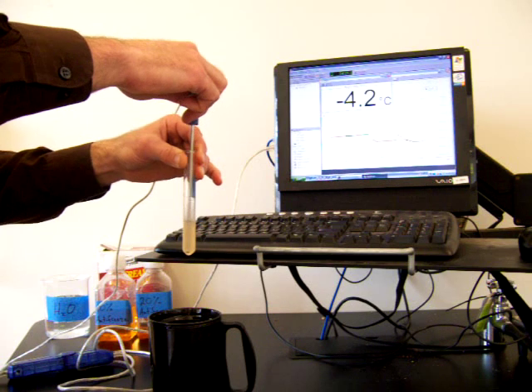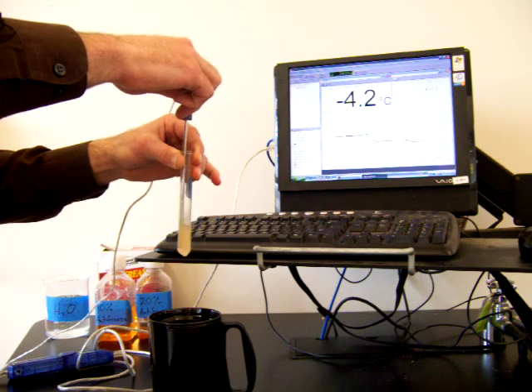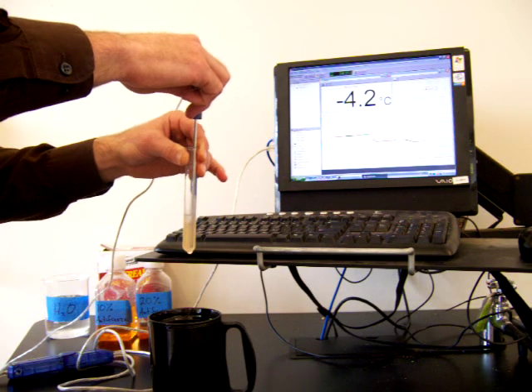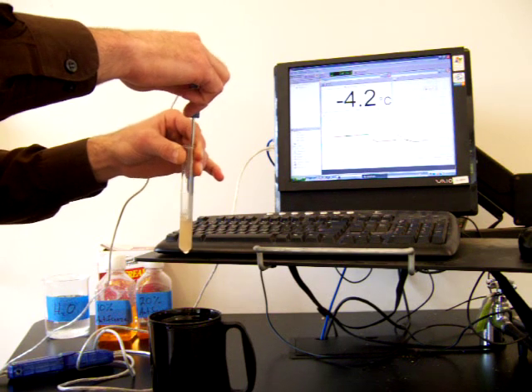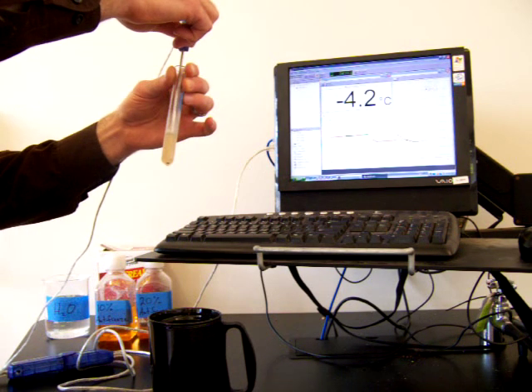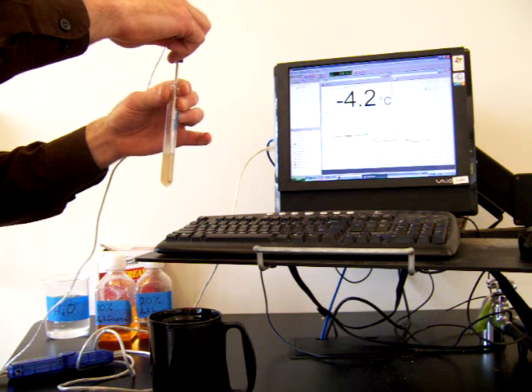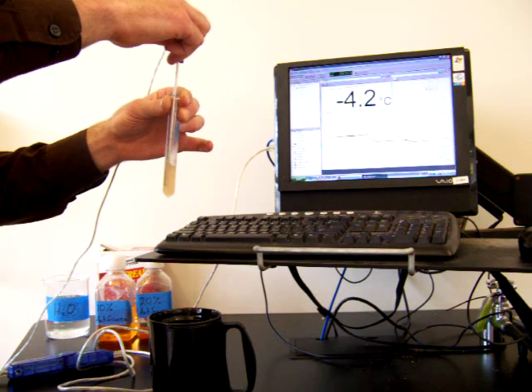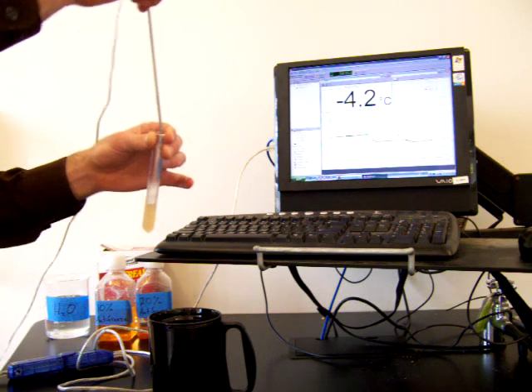So negative 4.1, negative 4.2, either one of those. Negative 4.1 or negative 4.2 is when the ice began to form. Okay, so we saw supercooling and then we saw the temperature level off as the antifreeze solution was changing from a liquid to a solid.